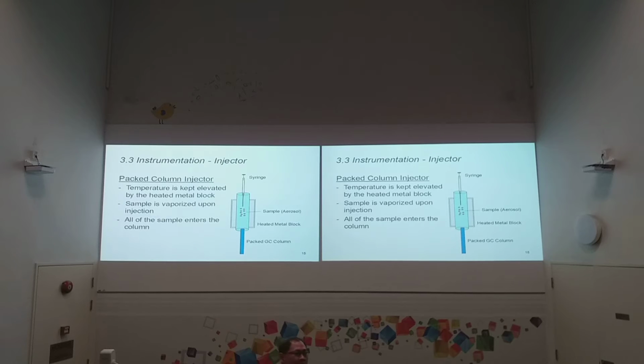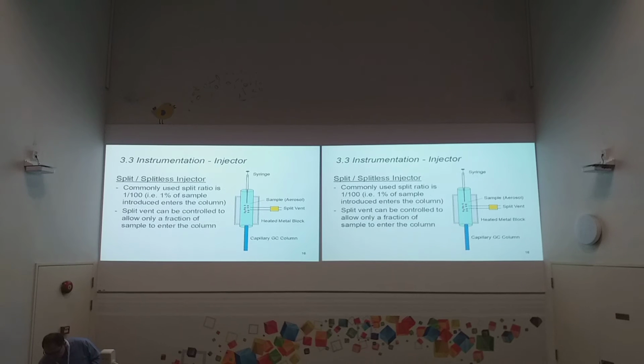With a syringe, it's very difficult. So that's why later on, based on experimental results, scientists realized that the packed column and a single injector, for directly introducing the sample into the column, come with a limitation. What happens if we just need a tiny bit of the sample into the instrument, into the column?